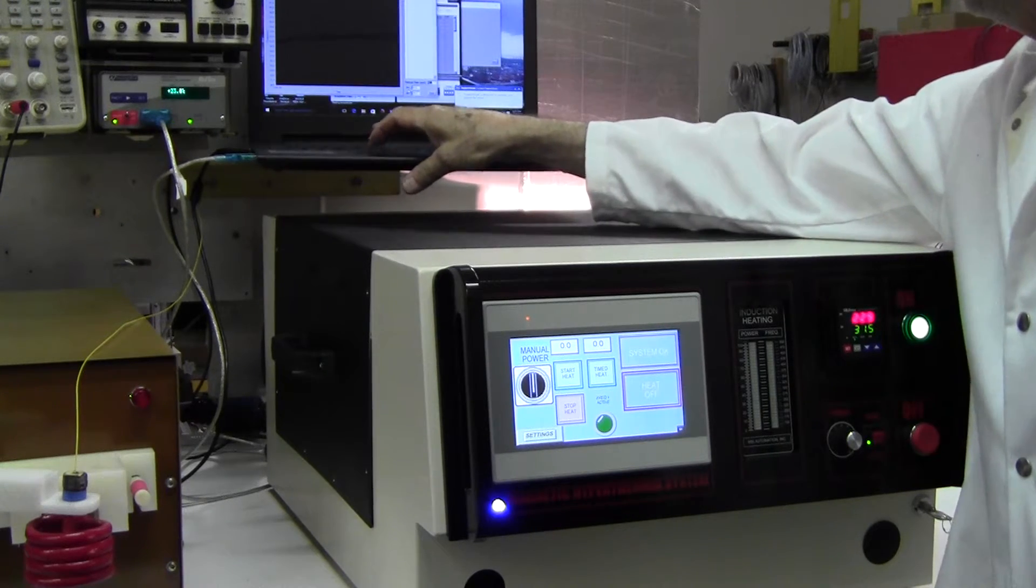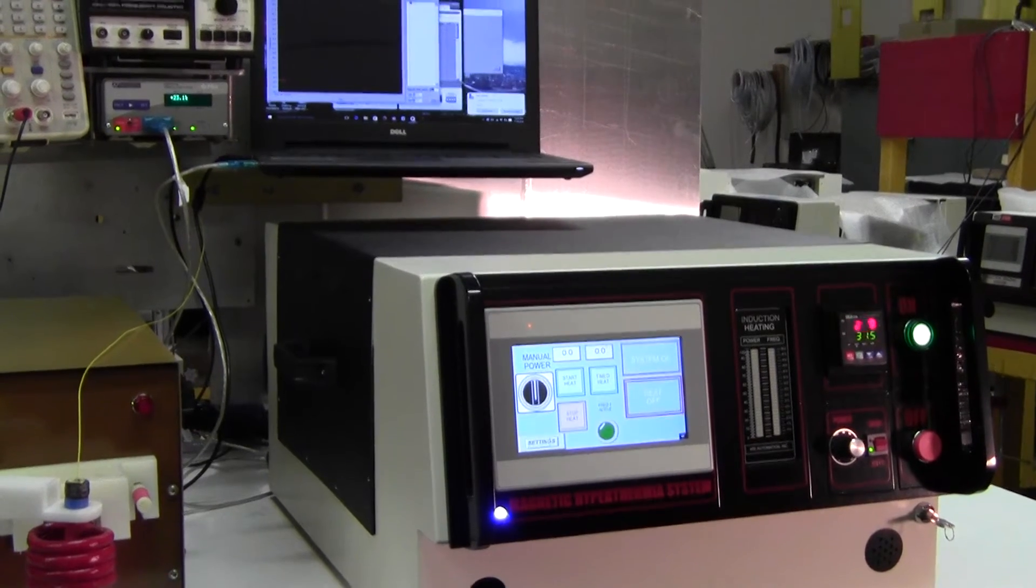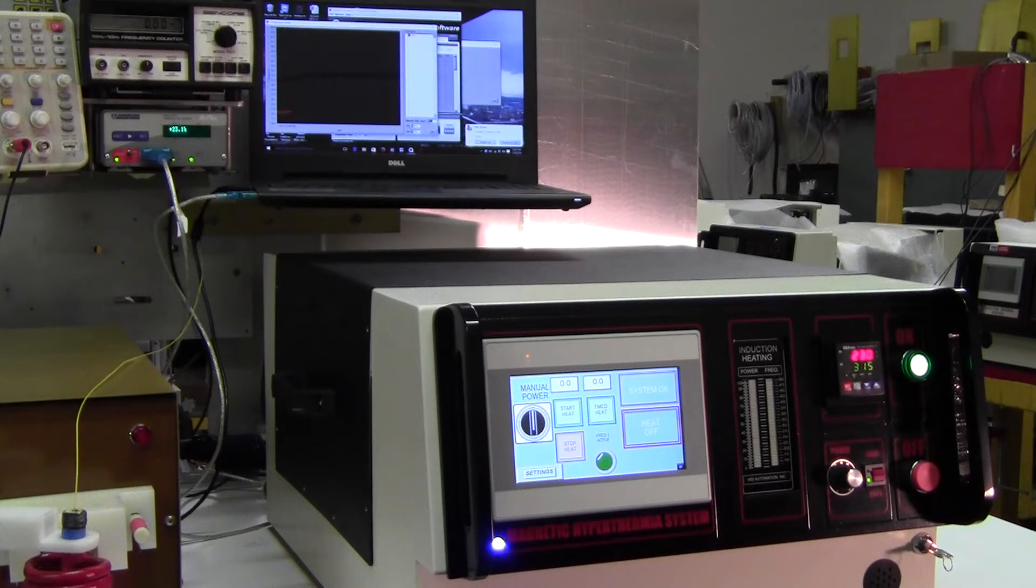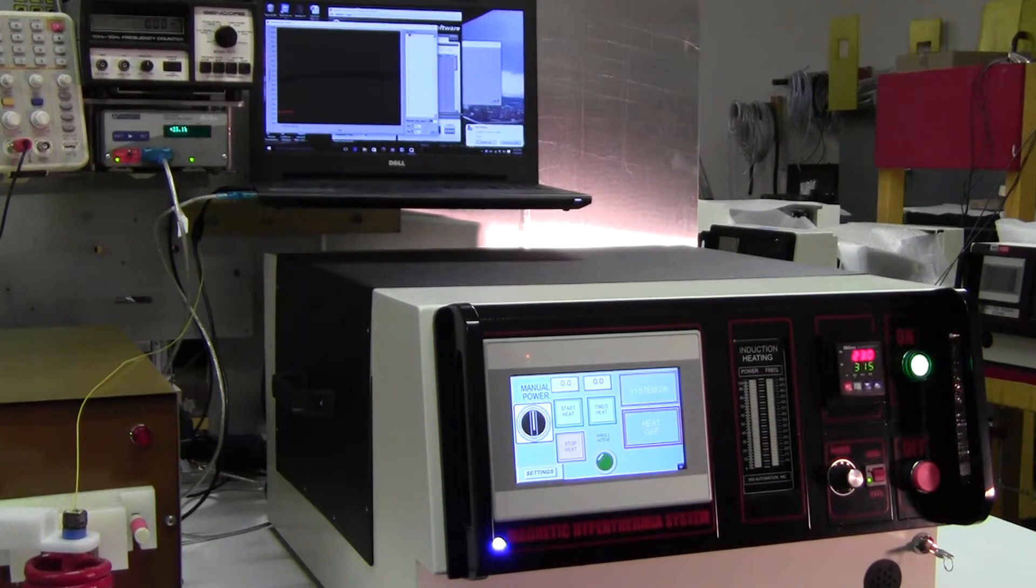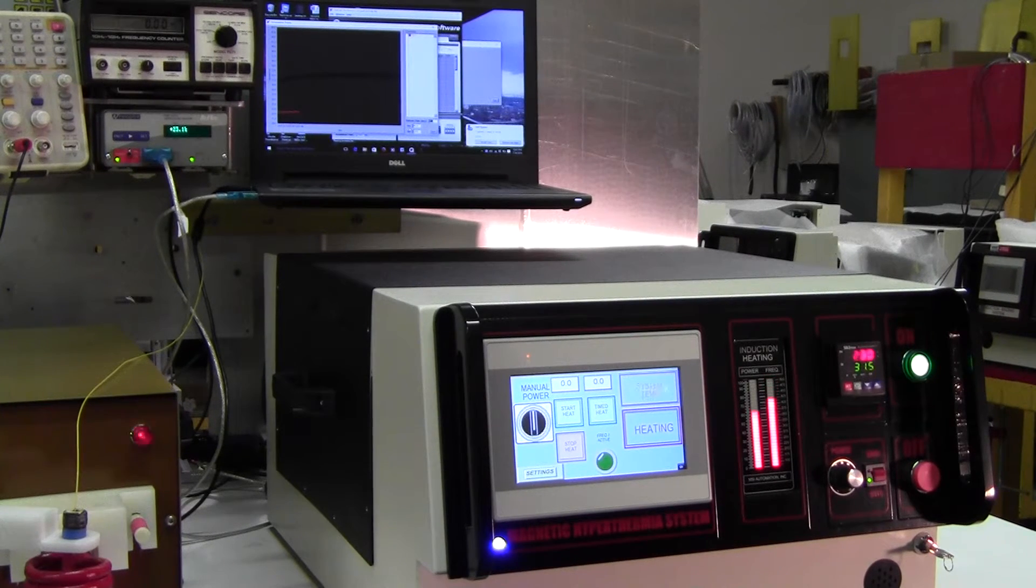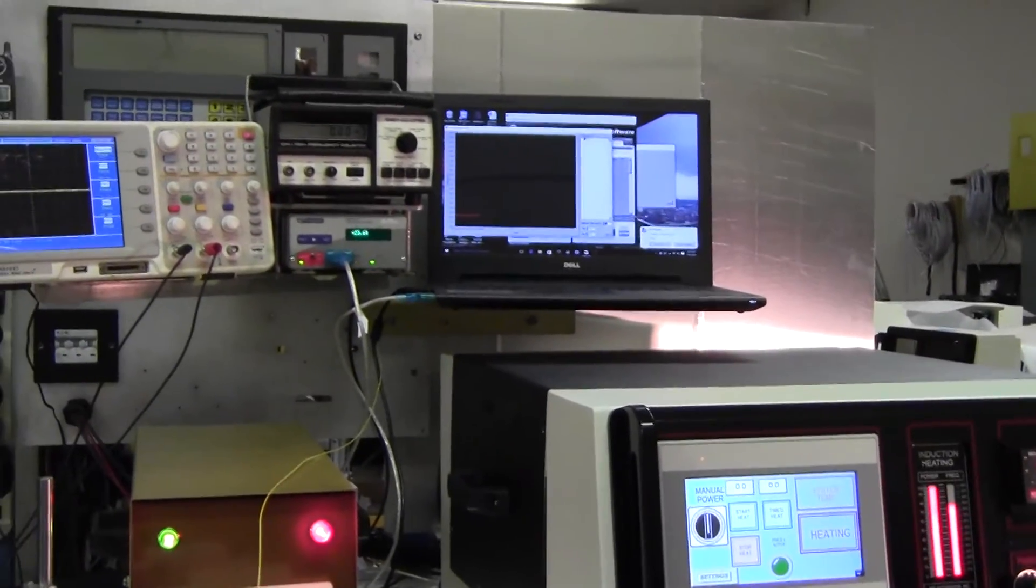I want to reset the bar graph, excuse me, the XY coordinate graph. So what we'll do is we're going to heat. You can see we're flatlining right now. Power's on. Full power. Now I'll zoom in on the display and we'll see what happens.